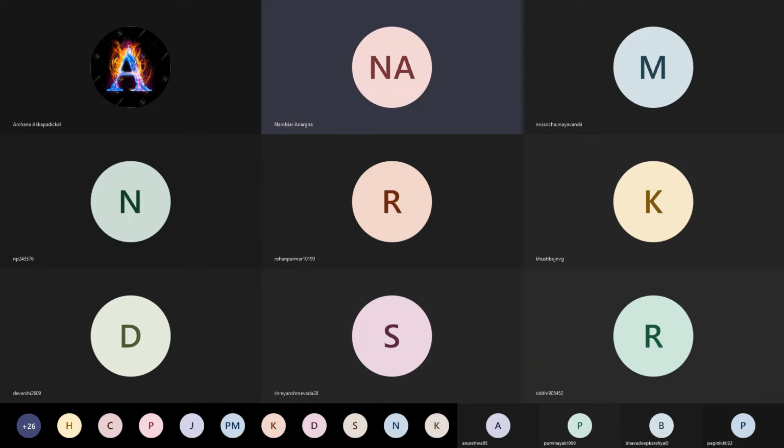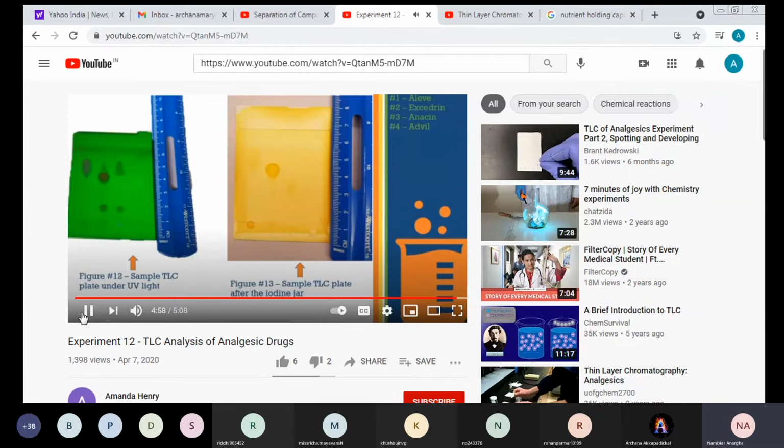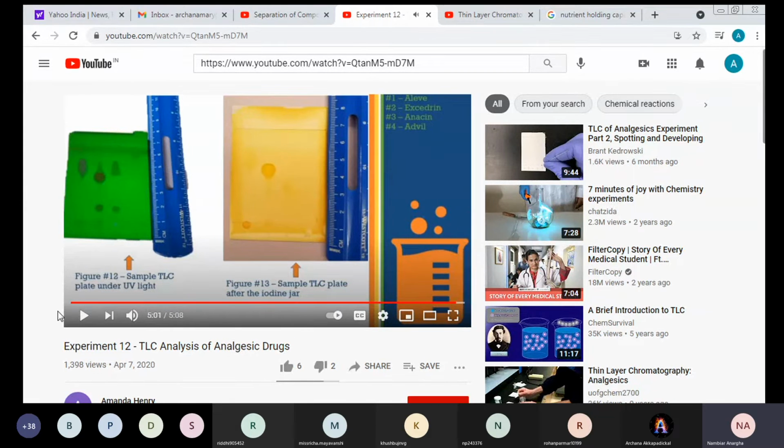Can we have a look at it? See here you can see how the spots look. Those are brown, not dark brown. The cursor now shows the spots which are almost brown in color. We can see how the spots are separated, and that they are brown in color.